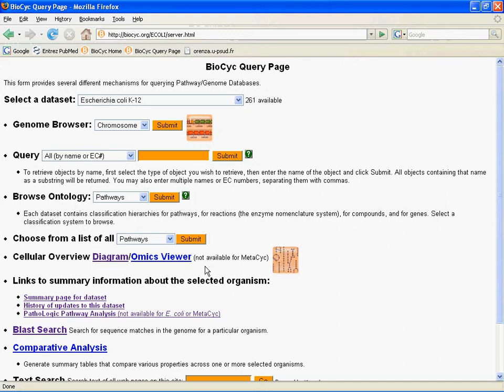In Part 1, we showed you an overview of the cellular overview diagram — what it contains, what you can view with it, and using it to view different organisms. In Part 2, we're going to tell you how you can use that to view omics data. You'll recall we ended on the BioCyc query page, because the query page is how you access both the overview diagram and the omics viewer.